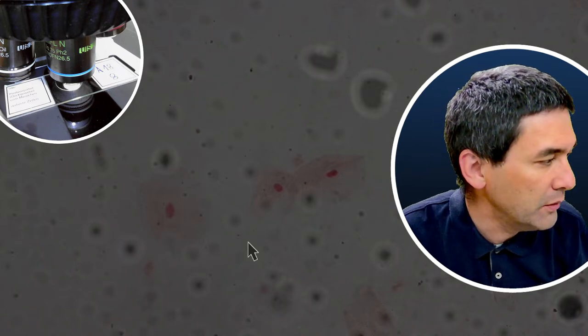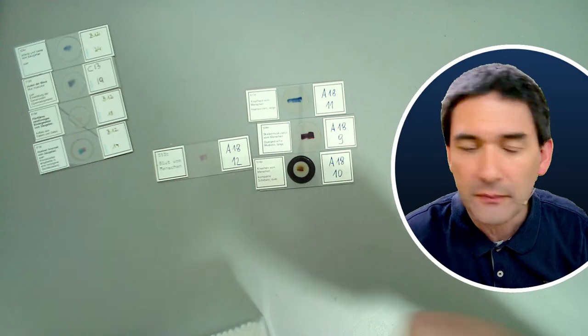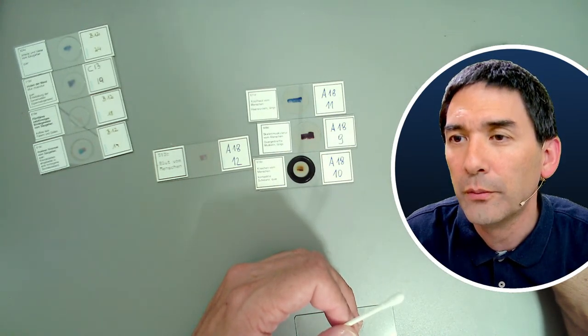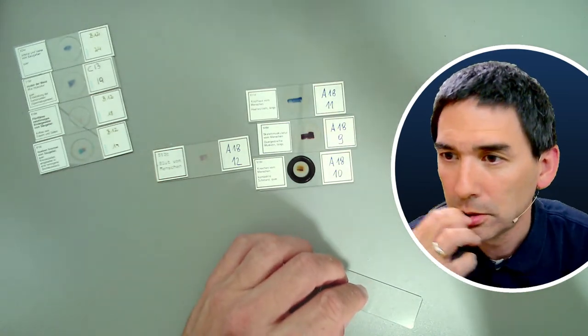Okay, so what I'm going to do now is primarily for those of you who have not seen this yet. I'm just going to show you how to make a sample from my own mouth. We'll have a look at this. Okay, but I see that there are a couple of questions already here for me. I need to go down quickly, and in the meantime, I'm going to take some samples. You just basically rub a little bit here.